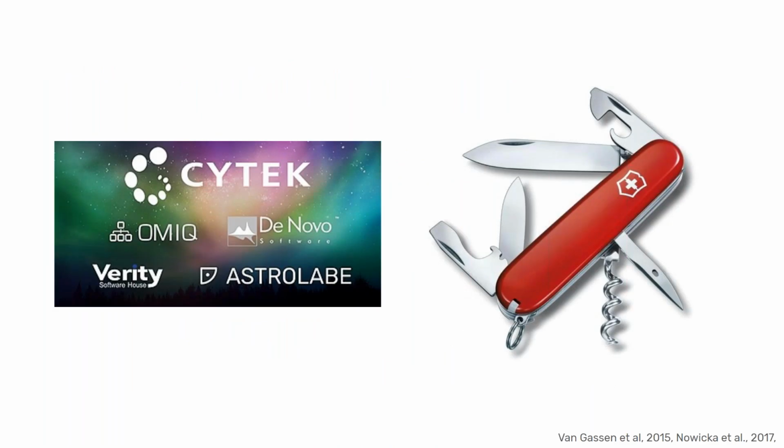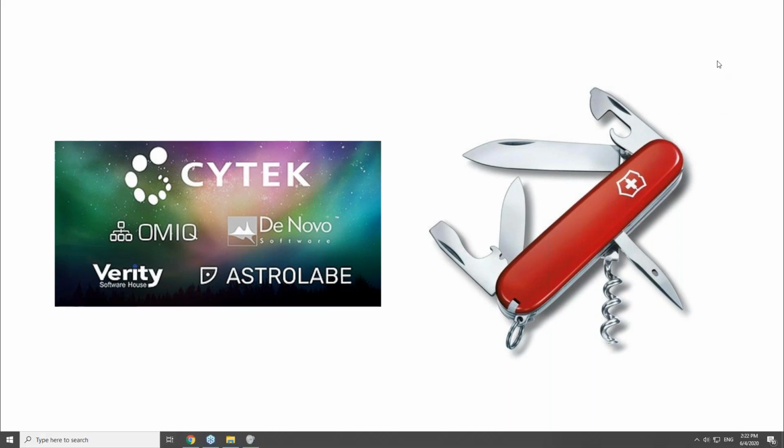And I'm really appreciative of this day that Cytek organized. I think that out of the many instrument manufacturers that we work with, Cytek is the one which is most mindful of the kind of challenges their users are facing, whether it's building the panel, acquiring the data, quality control, and of course, analysis. And I'm proud to say that I have experience with the different tools that we've heard about today. And I used to think of these tools as the Swiss Army knife.